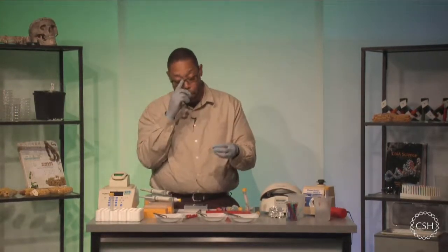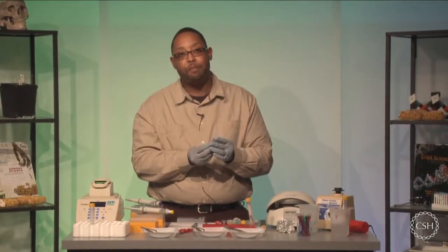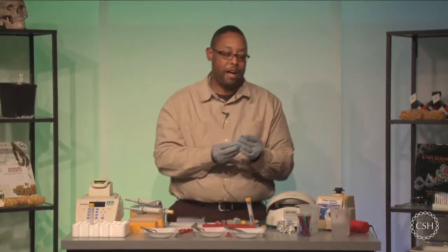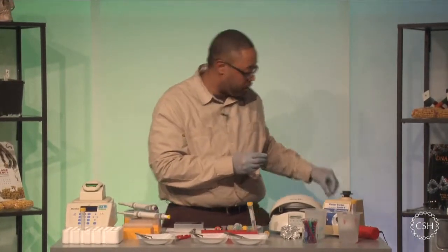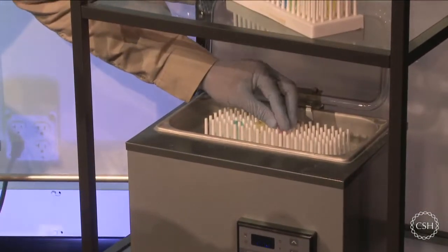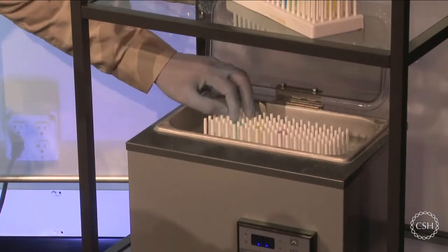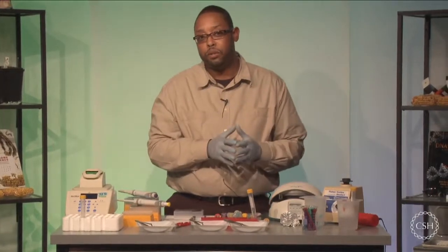Now, after you have all of your sample test tubes mixed, you're going to then want to incubate them briefly at about 57 degrees Celsius for about 5 to 10 minutes. So now I'm going to take these samples and shift them over, and place them into the incubator. At this time, you'll just want to make sure that you have everything else that you need set up, and then move on to the physical next step.